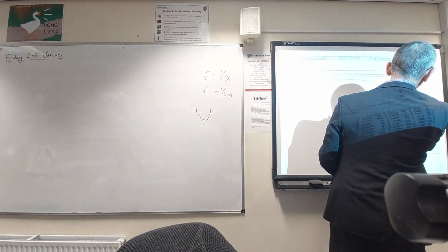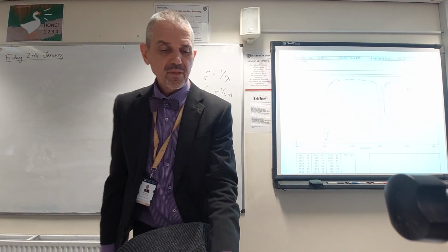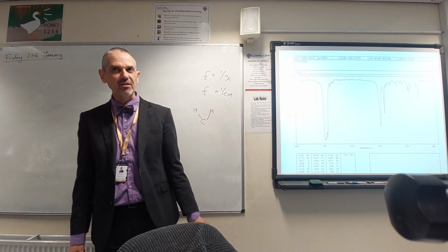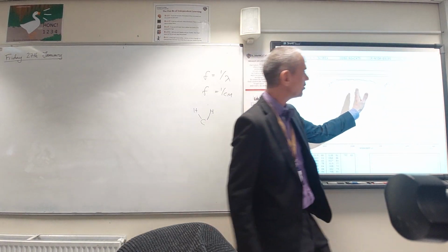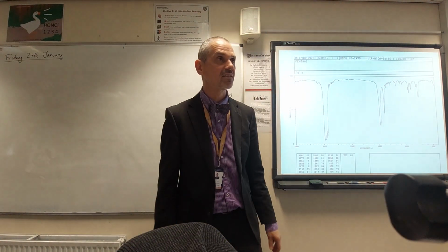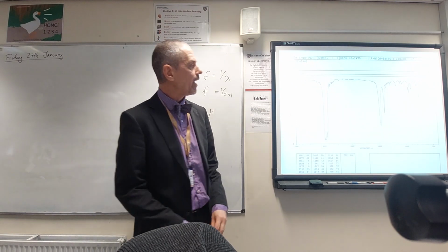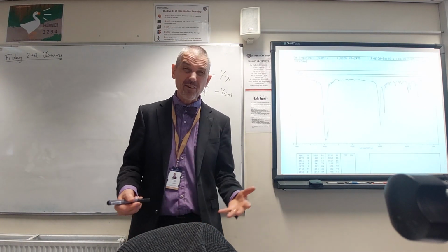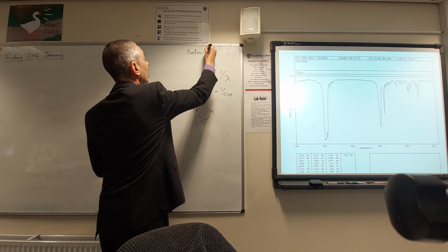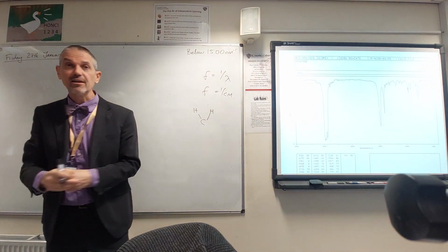It's anywhere in there, so there's probably some carbon-carbon peaks in there, but it's not very easy to identify specific peaks, and this part of the spectrum can get very messy, as it is here, with all sorts of little peaks denoting all sorts of things. So as far as you're concerned, below 1500, you're not going to be asked to identify any peaks there.